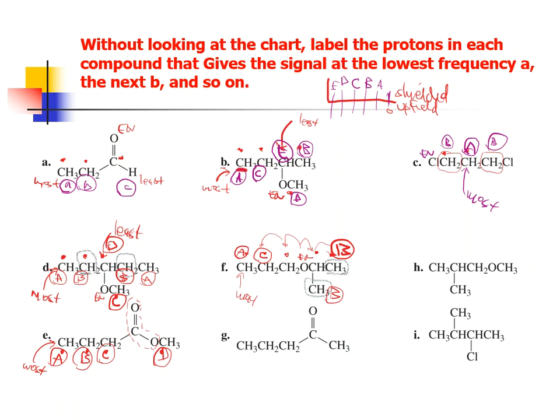And just like before, I'm going to have to use the number of hydrogens on this thing to determine which one would come next. So this carbon has 2 hydrogens to fight, and this carbon only has 1 hydrogen to fight. So because of that, this CH group, that carbon's going to beat the hydrogen up and take its money, and that oxygen's going to do it as well. It can do it a little bit better here. So this hydrogen that's on that particular carbon will be the least shielded out of the bunch, and this one would be next in line.